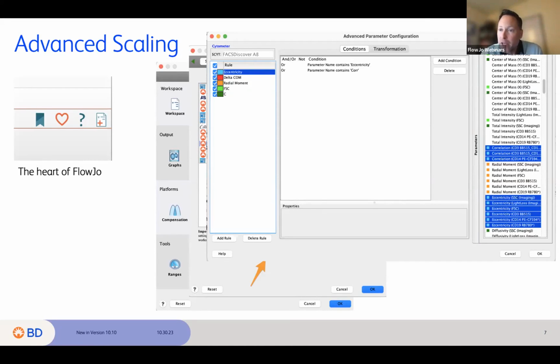I don't know. We've allowed that button to be there for people who want to do that. I have it as not being on by default. So you'd have to turn it on if you want that to happen. I don't know if you want your scales to automatically change from one run to the next, especially if it's just by a little bit. It's also possible that you will have it auto scale to the first sample, and that won't look great for the rest, that the rest maybe looked better on the default scale.